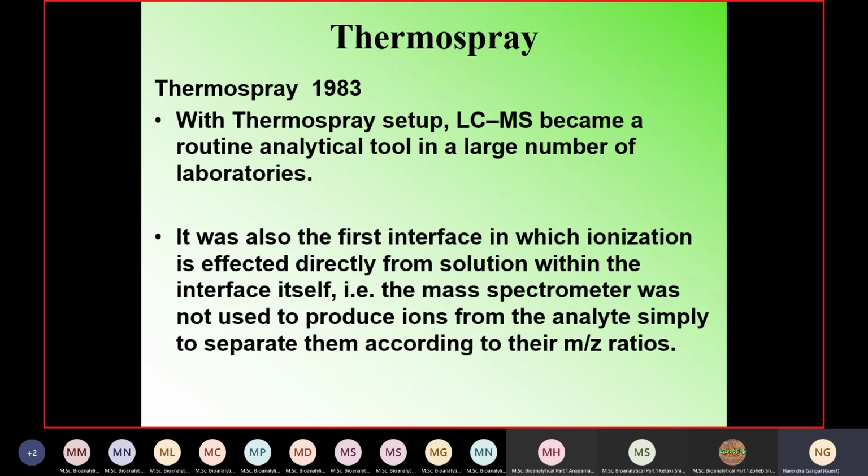So 20 ml is equivalent to 20 grams. Now if 20 grams of water I am pumping, it will generate about 22.4 liters of gas, because 18 is the molecular weight of water. So 18 grams is going to generate 22.4 liters. Everybody agrees now?